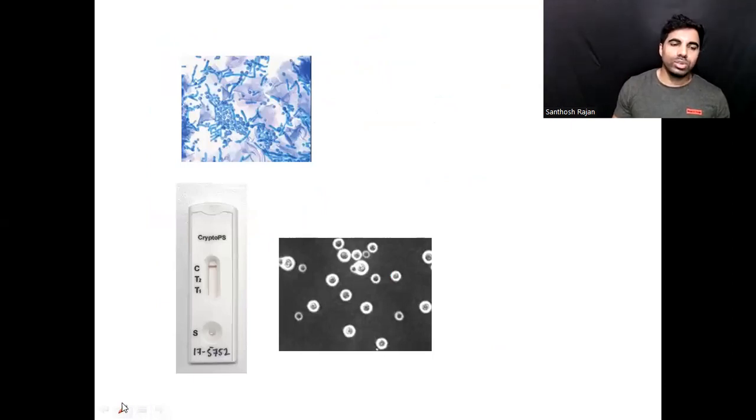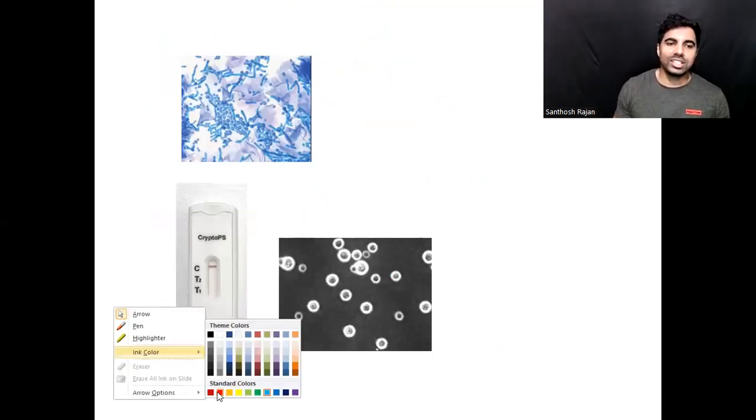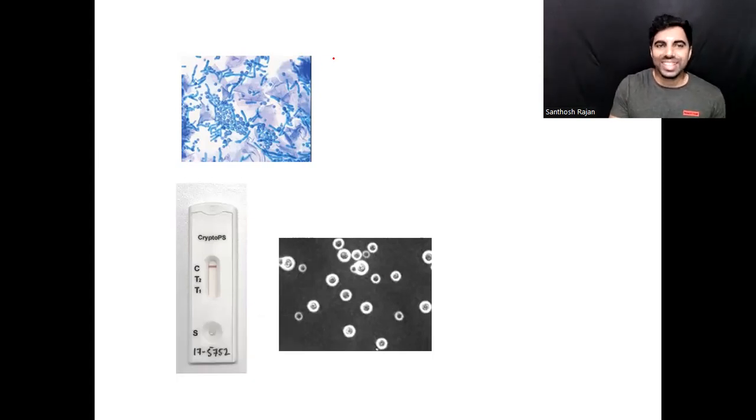Look at this one. This one, you will not make a mistake. I know that this is like a delicious food. What is this? You see the spaghetti and meatball. Spaghetti and meatball, or also what we call banana and grapes. So this is for which one?